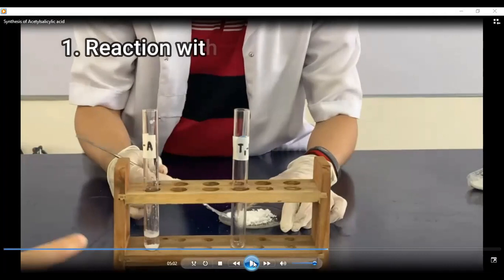So for aspirin, if you check its chemical formula, it should not give a positive result. This means it should retain the color of ferric chloride, so no color change is expected. But watch what happens in the procedure.